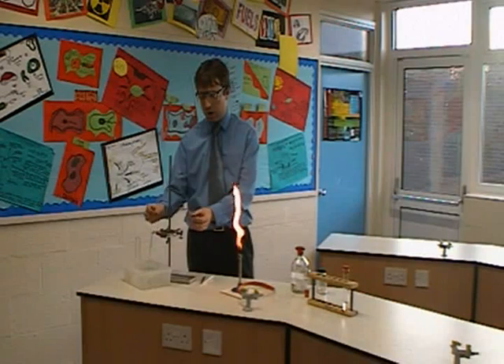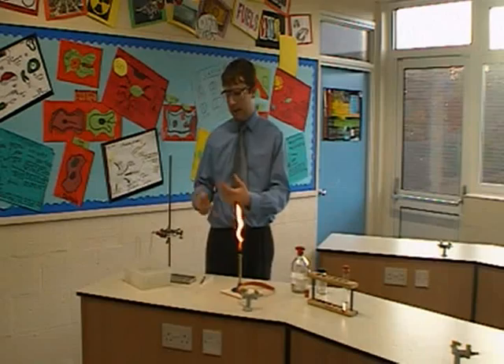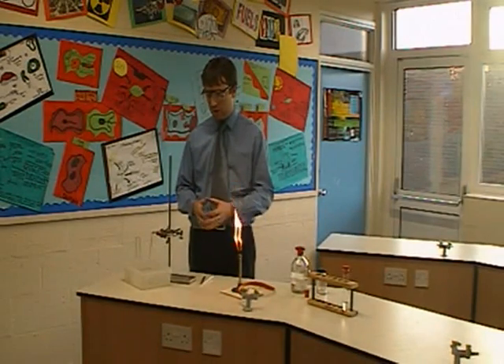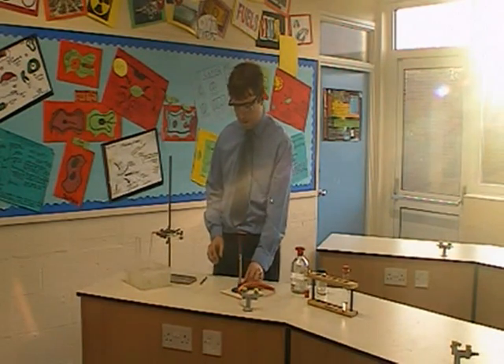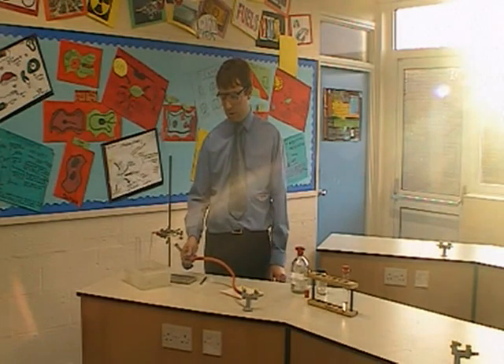As the reaction starts, the initial bubbles that come out are going to be air, so we're going to collect a whole tube of gas and eventually we'll be able to test that to see if the cracking process has worked. I'm going to turn my Bunsen burner onto a blue flame and start to heat up the catalyst in the middle of the test tube.